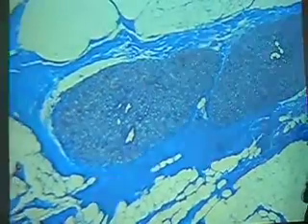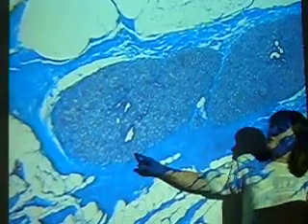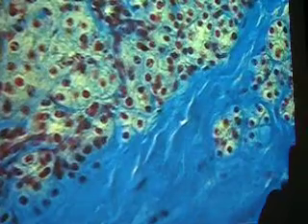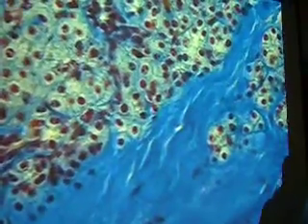And then I would, yeah, this is a parotid gland, good. And the tiny little structures under high power would be serous alveoli, and I'll put one of them up here for you. Yeah, so one of these is a serous alveolus. Okay, now I'm going to go to the next one. That's the parotid again. The next slide is the submandibular gland.